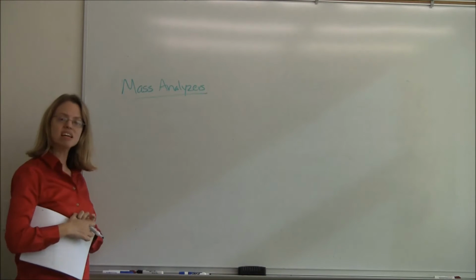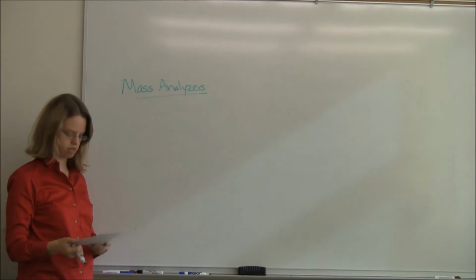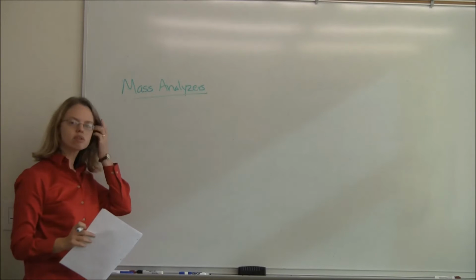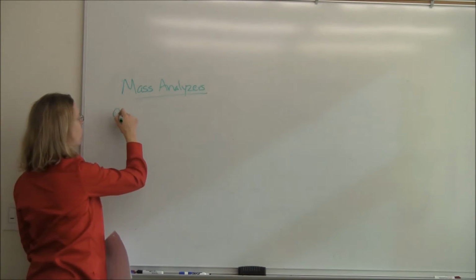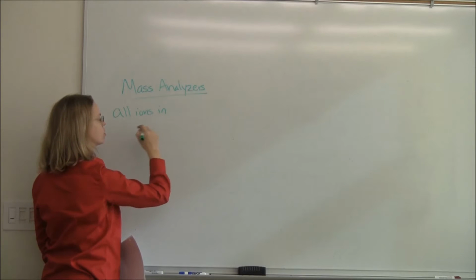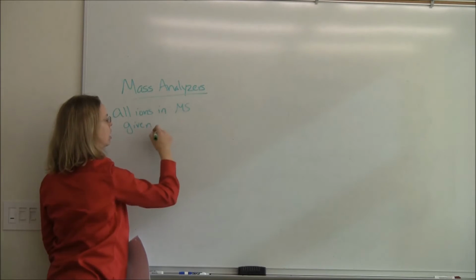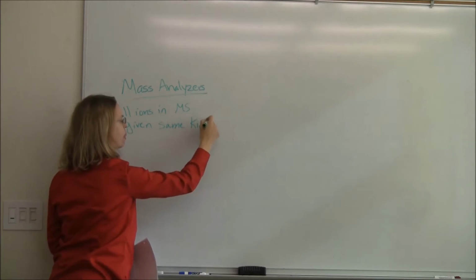Okay, so the mass analyzer is a critical part of the instrument because that's what's going to separate ions based on the mass to charge ratio. And this is based on a physics principle. The principle is that all ions in our source are given the same kinetic energy.